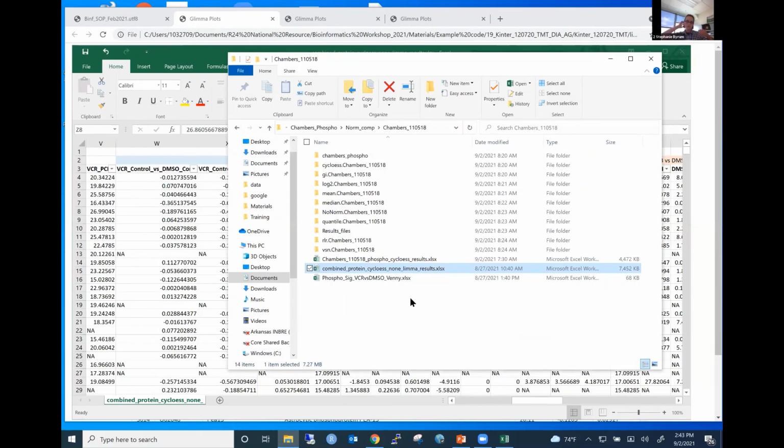So when we go through this full analysis, we'll run the ProteinGroups, and we'll give the metrics of what the methods look like. We'll tell you which ones we used and provide all of those differential abundance results. And then from there is where the real fun begins, and that's where you have to dig into the biology and figure out what does this mean?